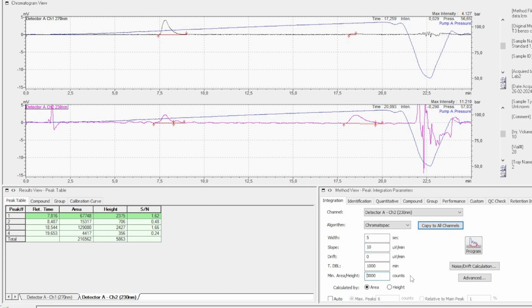So it's not always that you can get it perfectly so you don't have any peaks you're not interested in, but we can try and play around a bit more. Right now I'm looking at the left-hand peak. There we go. So this could be an option. Now I only get the peaks I'm interested in.